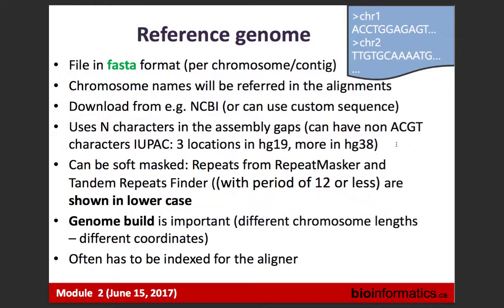as NCBI provides us with a reference genome, there are lots of unplaced chunks. They are a real pain when we try to do downstream analysis because many tools don't recognize those names. Many tools break with those names. But they are important because they contain genes and real sequences. The only thing is that our modern assembly knowledge doesn't allow us to place them properly in chromosomes. We know there are only 24 chromosomes, but we don't know where to put them.